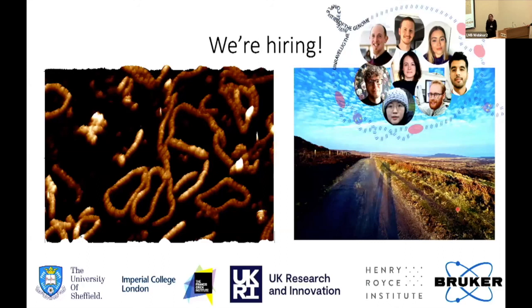No, we haven't. But one of the things we're currently doing in the lab, we have a 336 and a 339. The idea is that we have one that wants to be in two different conformations and one that doesn't. So we're looking at tuning it by differences in length rather than having ethidium locally in the AFM, if that makes sense. So sort of defining how happy it is to be in those different topoisomers.